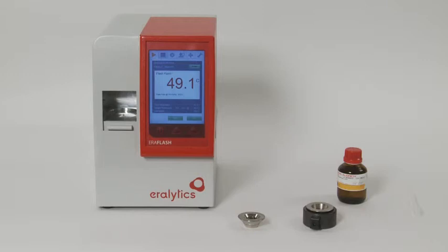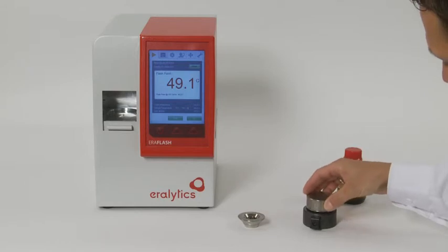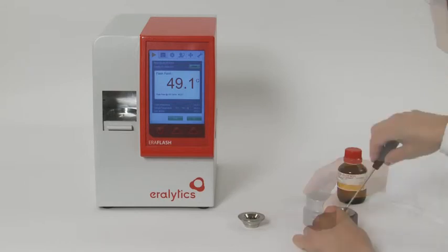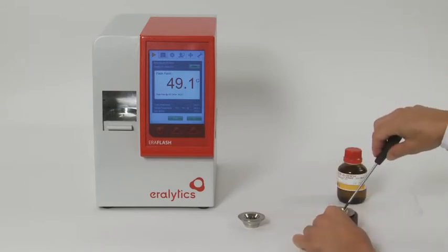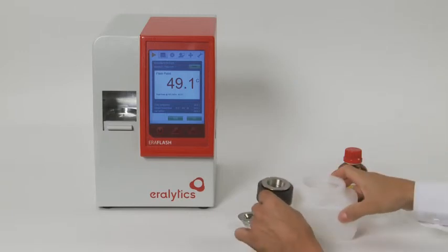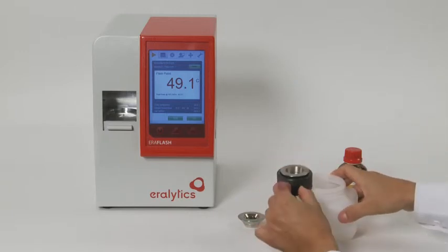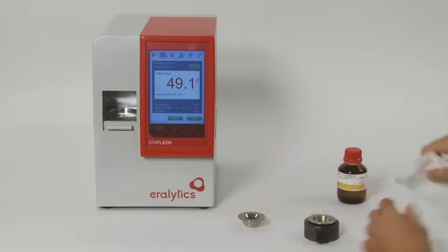Cleaning: After high temperature measurements, cool the sample cup with the optional cooling block. Take out the stirring magnet, empty the cup, and clean it with a tissue.